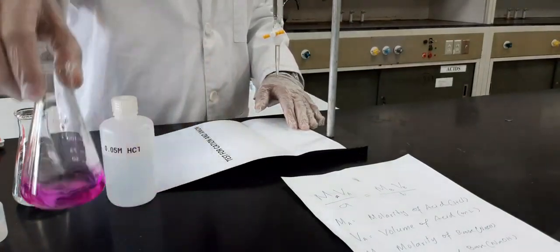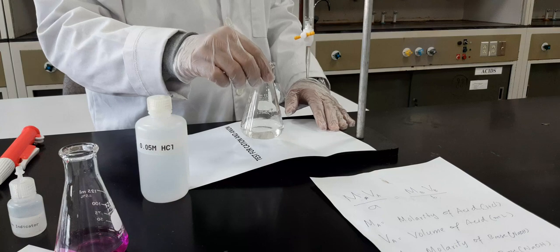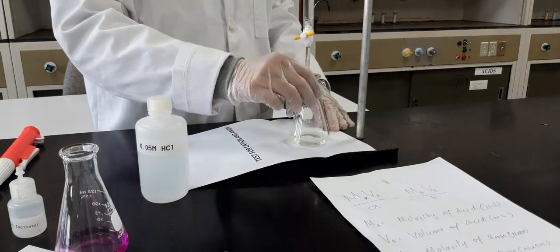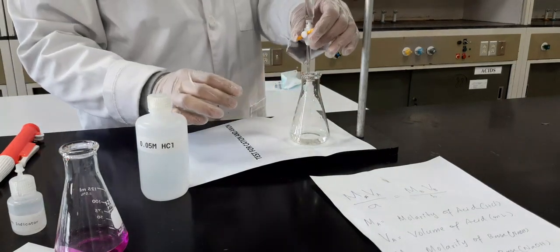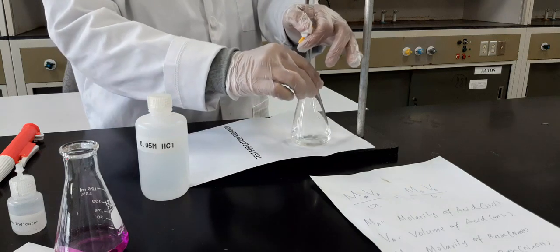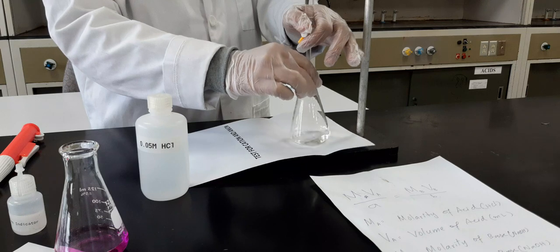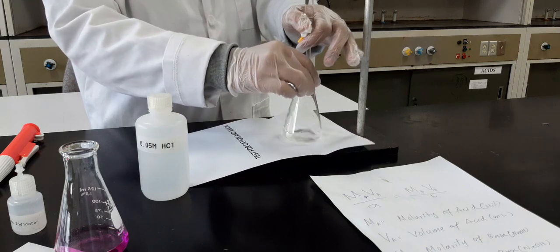Now you finish this one, then go for the second conical flask, because you have to repeat this experiment at least 3 times, and you will take the average volume of the base. Now we'll put it there. We start from 4.5, you know it already. Let's start the titration again, a little bit faster because I know the volume, but the main thing is I should look at the color change, not the volume, because I will stop the titration when I see a permanent color change.